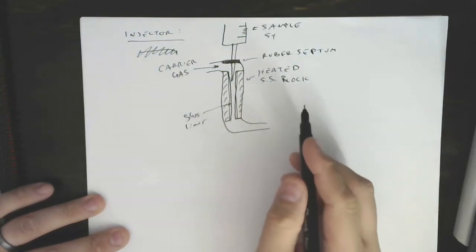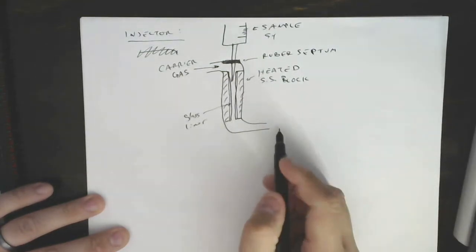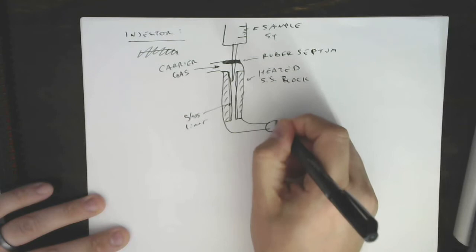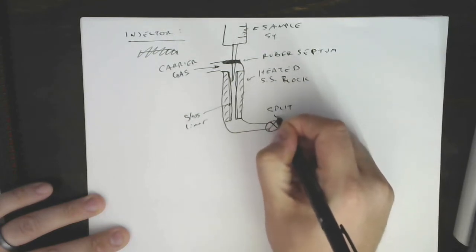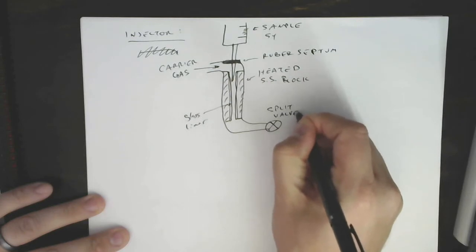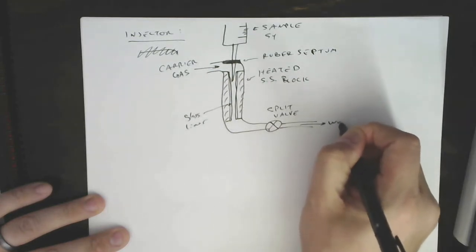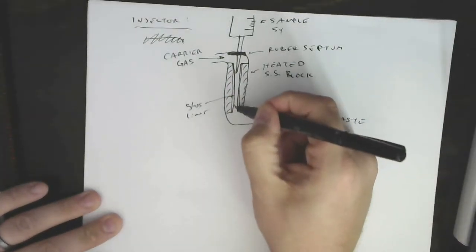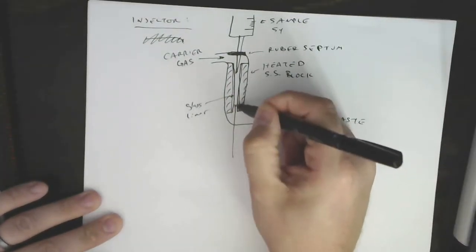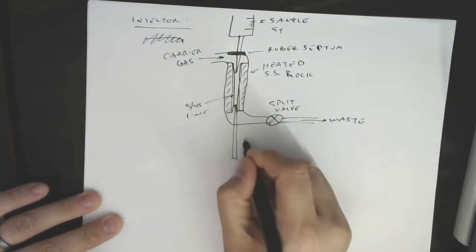It's generally heated to above the temperature of the column. We'll talk a little bit more about that in a minute. And there's an outlet here. That outlet goes to a valve. This is going to be called the split valve, which just leads to waste. There's one thing missing, and that one thing missing is that our column connects like that. So that's our column.